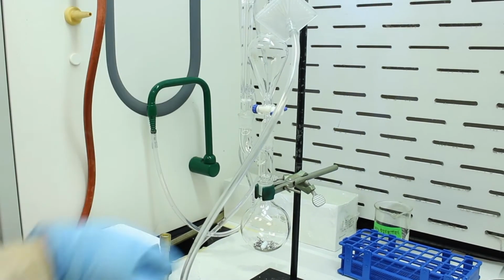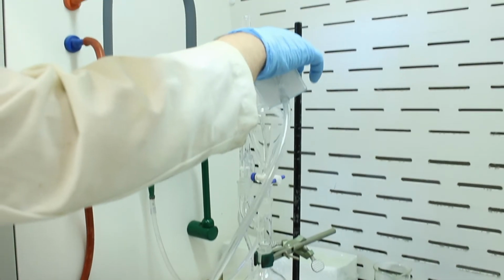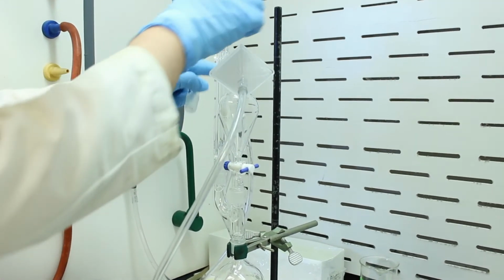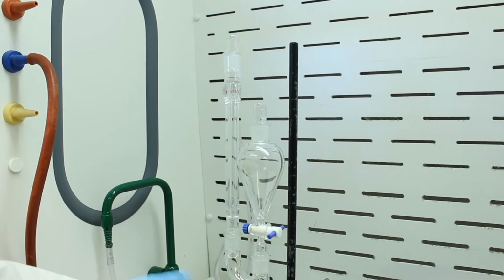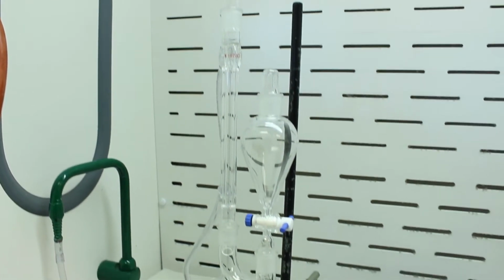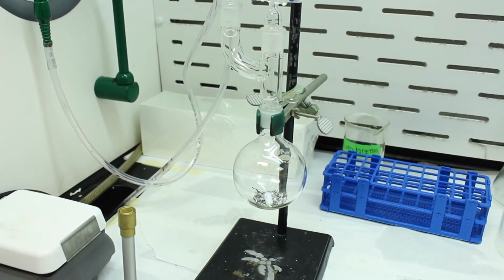Okay, so we heated it and pulled it under vacuum. We'll take the vacuum line off here, and then we'll replace this with a stopper because we don't want any water vapor to get back inside. So just take that out and put a little stopper in there. Now the apparatus is hot, so the glass is still very warm. We're going to let this cool, and then we'll start making the Grignard reagent.